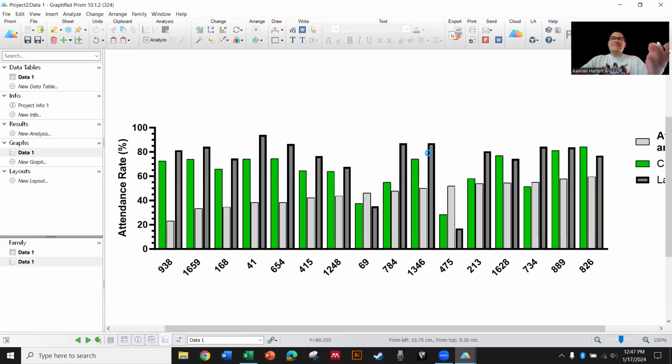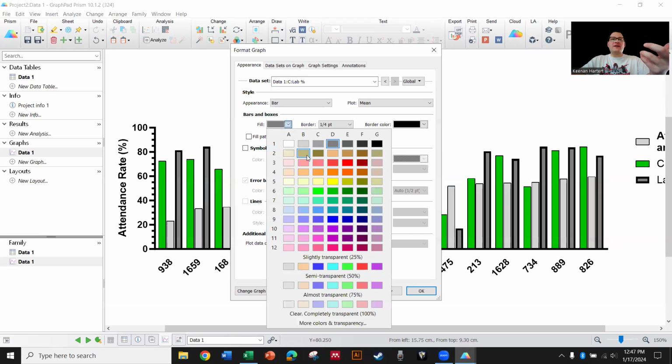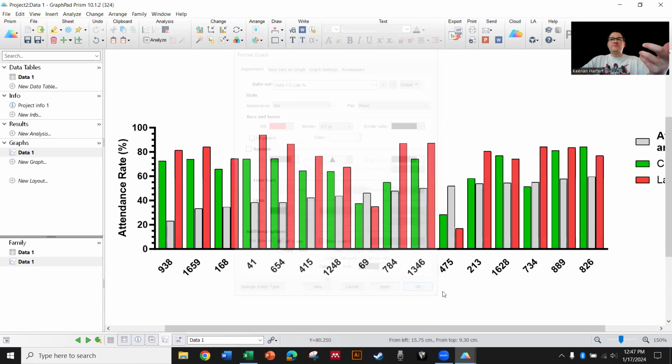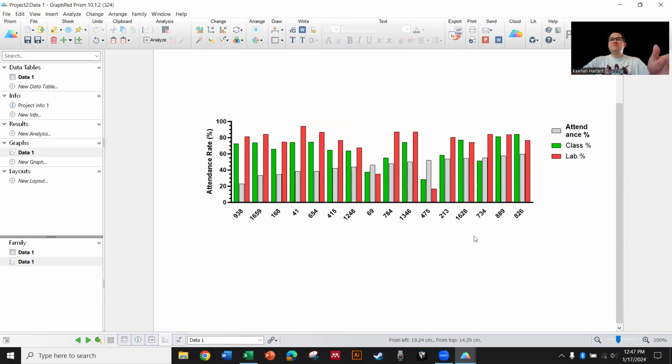Nice. Now, anytime you add a new group of data, it's going to come in the standard, kind of gross looking format. So just give it a little go like that, and you should be okay. You can zoom in, make sure everything's looking okay. Cool. So if this is what you wanted to arrange, definitely not bad.